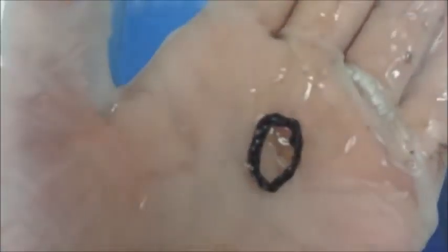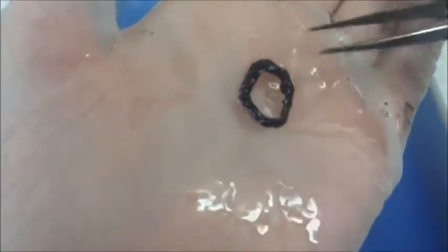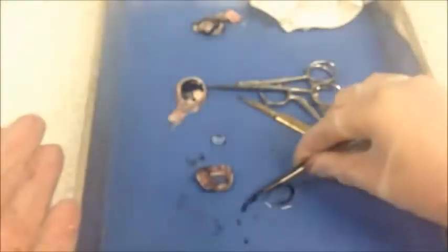You can probably see the pattern of muscles around the iris. There are tiny lines spreading out from the pupil. What I think of to describe this is the black part of a mushroom.